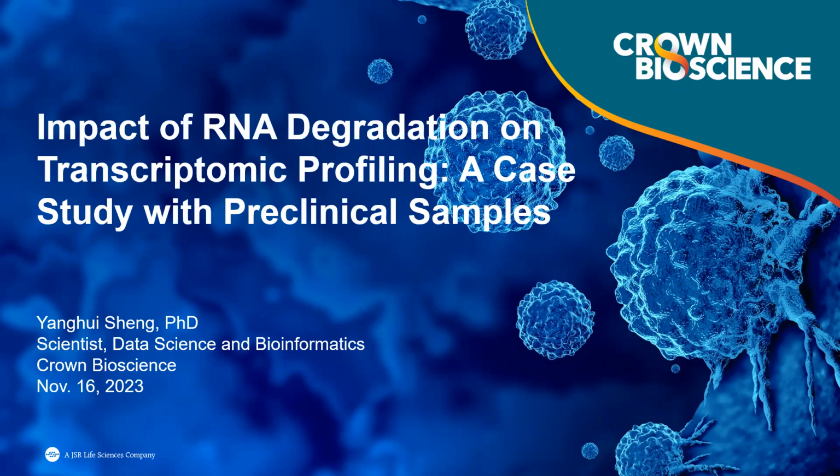The topic of my presentation today is the impact of RNA degradation on transcriptomic profiling. In particular, I'll be focusing on high-throughput next-generation RNA sequencing, which is currently the most widely used technique for measuring the expression levels of transcripts in cells and tissues.